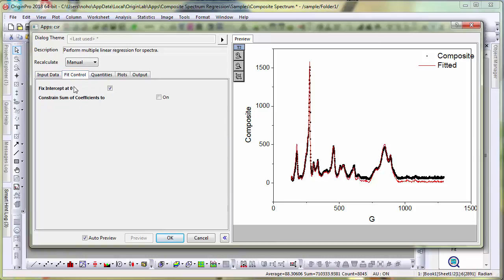Here we have an option to fix the intercept at 0 which makes sense when you are looking to figure out what contribution comes from each spectrum. There is no offset, and there is also a constraint that one can place on the sum of the coefficients.